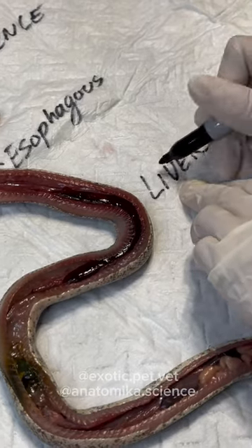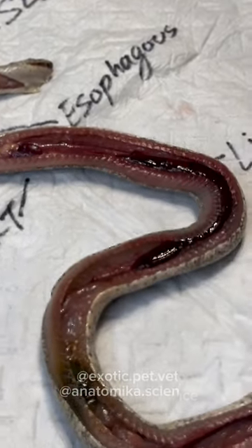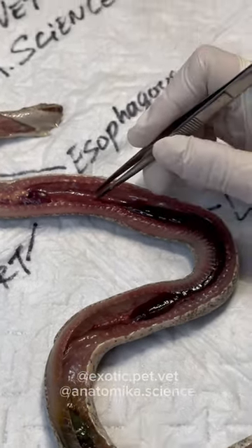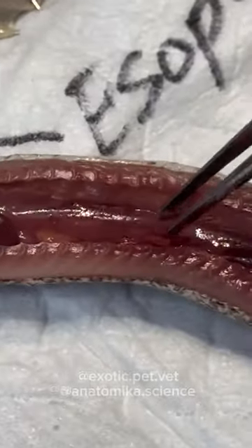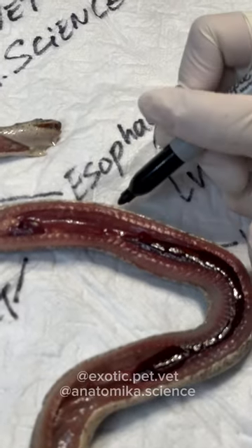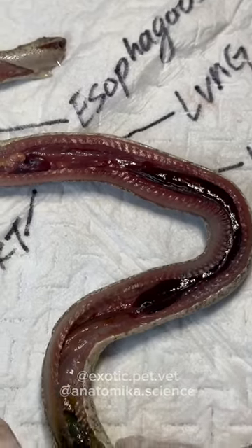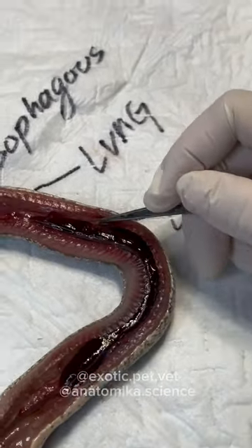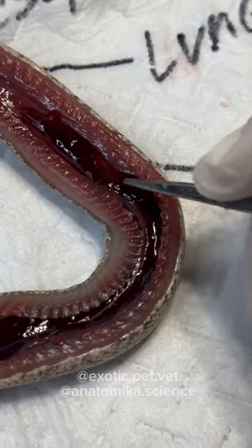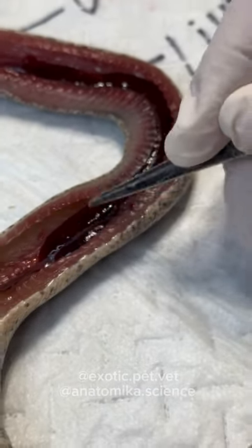We have the liver right here. Between the heart and the liver, but going down past the liver, is the lungs. Snakes have septate lungs — somewhat hard to see, but this pink tissue kind of looks like a sponge. The liver is a bit interesting — there is a mottled spot right here that is not normal, and there's a lot of mottling further down that is also very abnormal. So there's something going on with the liver, we don't know what.